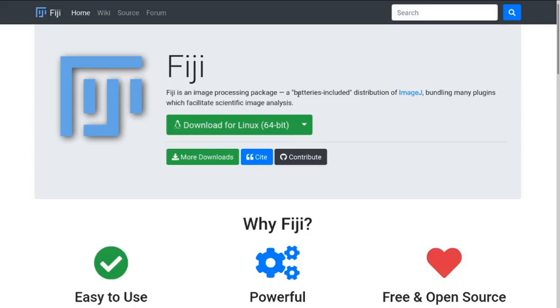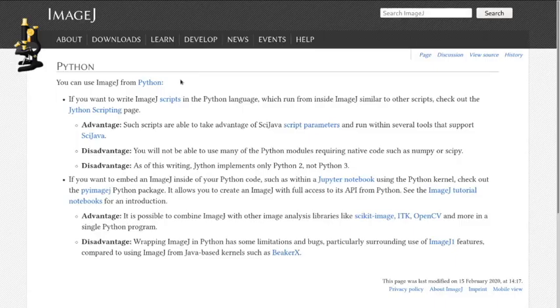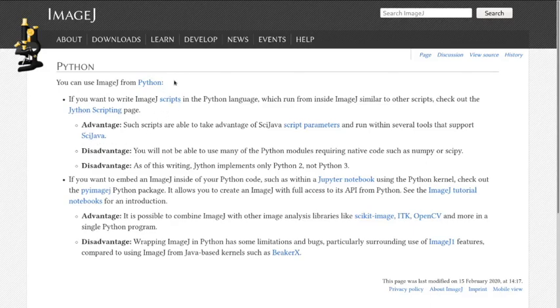So this is all relatively experimental. First of all, someone asked the other day why use Python inside ImageJ. ImageJ has very kindly given some advantages and disadvantages. But today we're going to talk about using ImageJ inside Python.